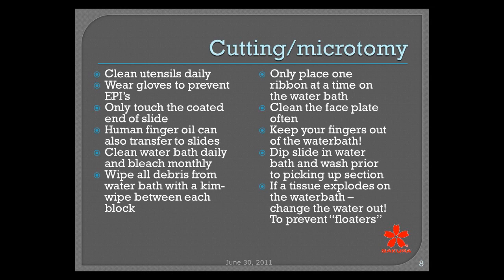I have a habit also, when I pick up my slide and put it in my water bath to go underneath my section, of dipping it up and down a couple of times just to wash my slide a little bit. That takes off the dust particles that are floating around in the air before I pick my section up on my slide. And if you have a tissue explosion on your water bath, change your water out.